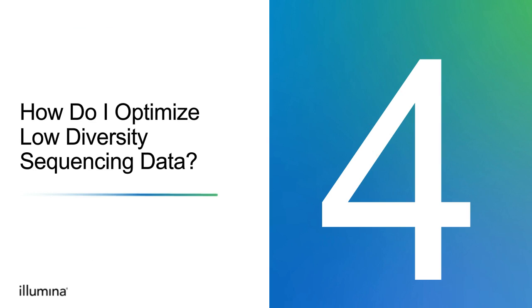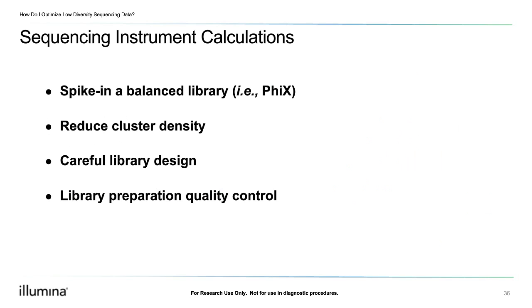Now that we understand what nucleotide diversity is, how to determine the base diversity of our libraries using run metrics, and how base diversity impacts instrument sequencing run performance, let's take a look at how we can optimize our sequencing runs to handle low diversity libraries. We have four main strategies: spiking in a balanced and diverse library, reducing the cluster density, careful library design, and proper library preparation quality control.